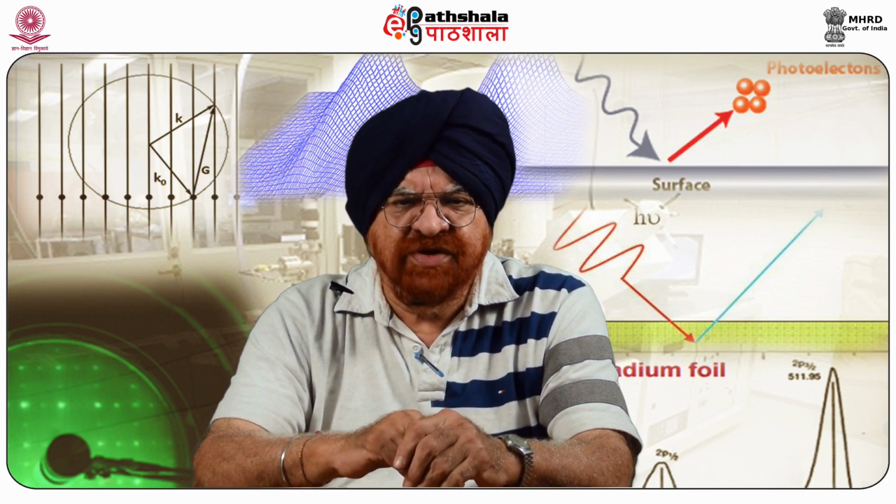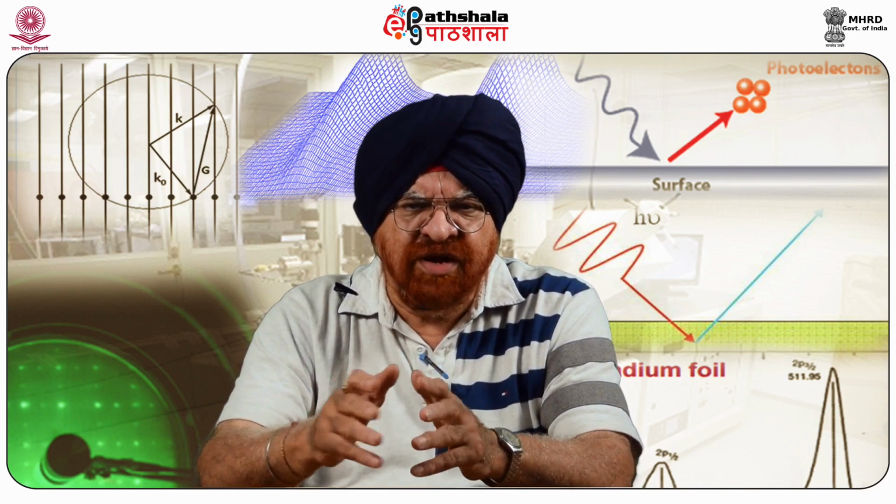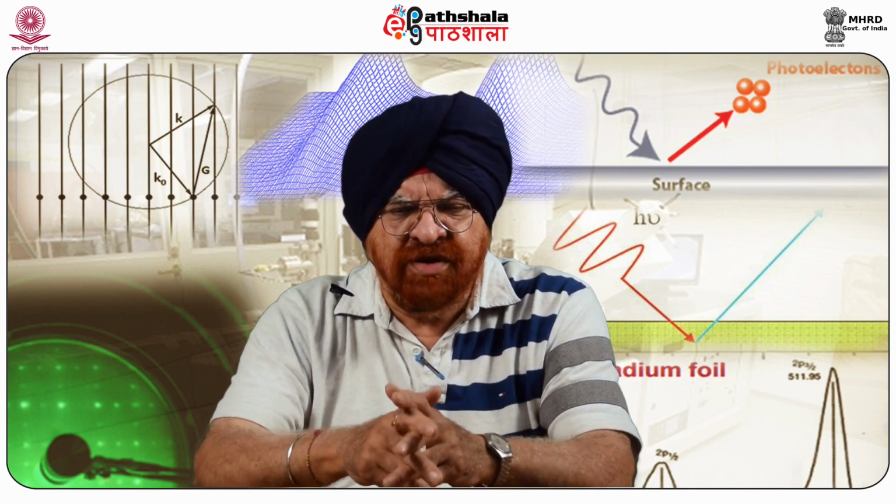XPS, as I've said earlier, is also a surface chemical analysis technique that can be used to analyze the surface chemistry of a material in its as received state or after some treatment.